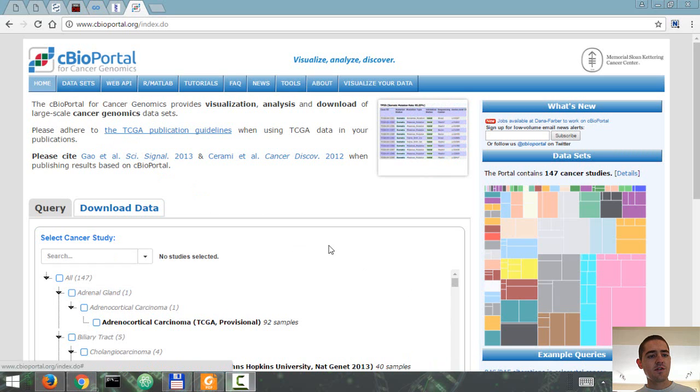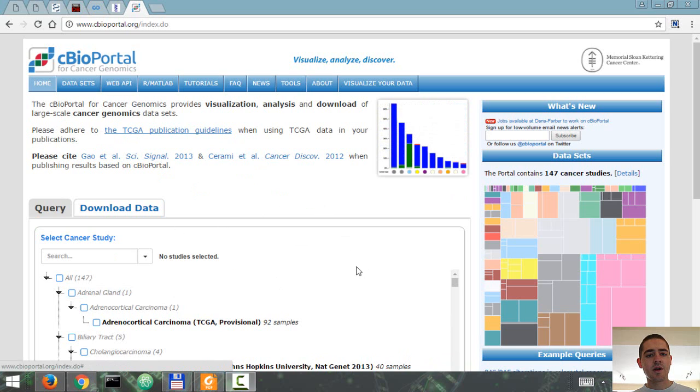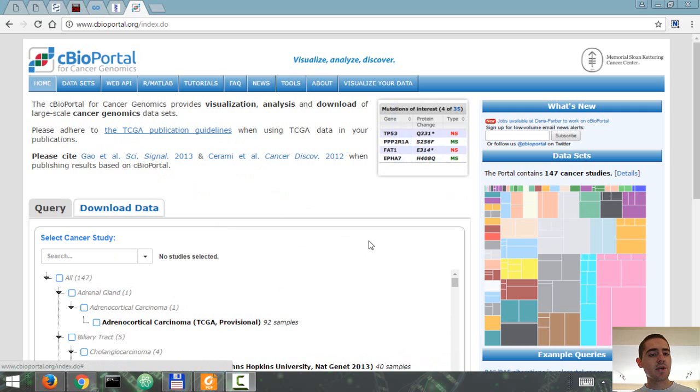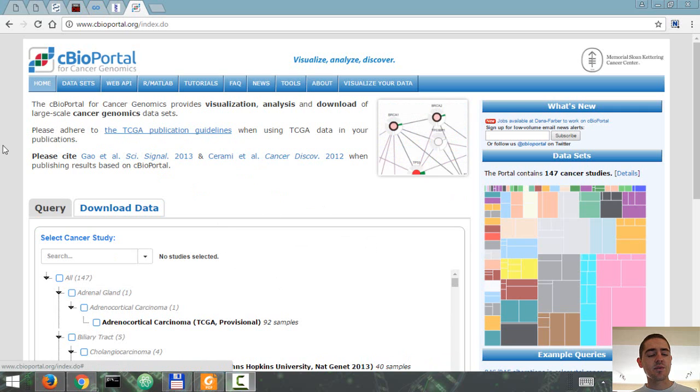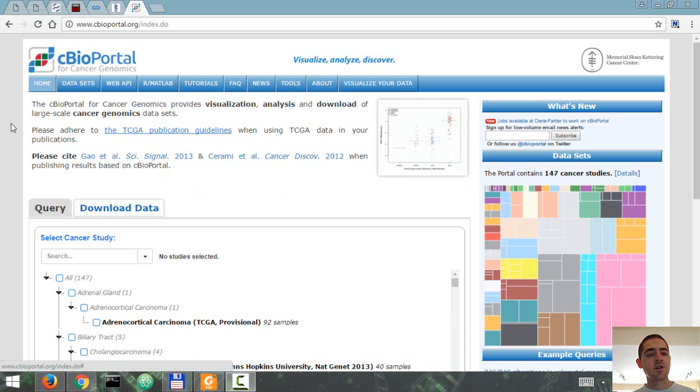I want to give you an overview of cBioPortal, which is a platform that helps you analyze, visualize, and download cancer genomics datasets, which I think is convenient when you want to conduct research through publicly available data.